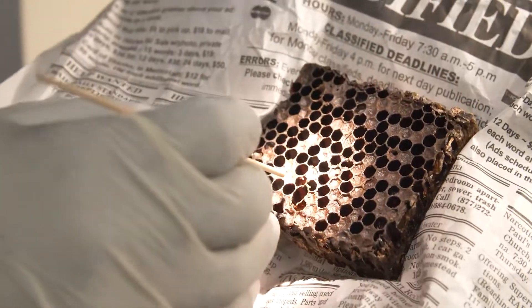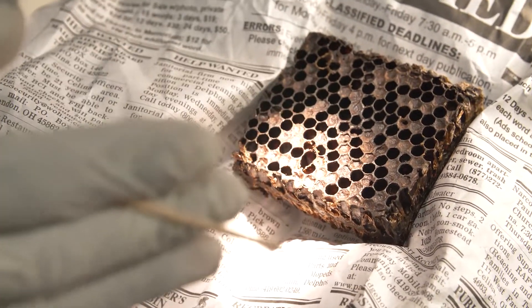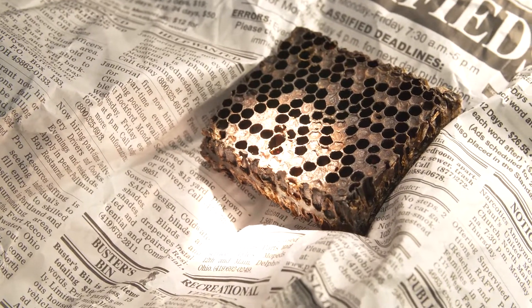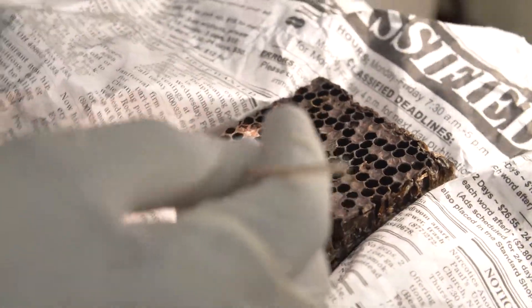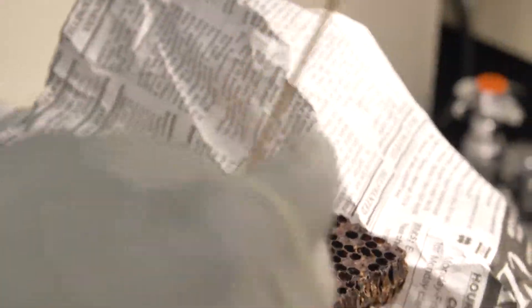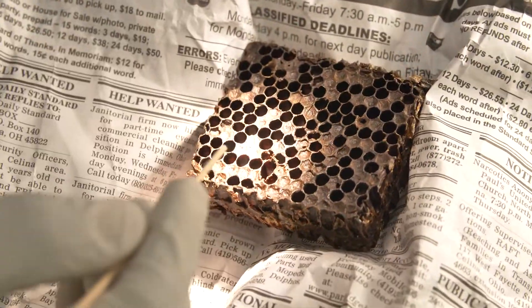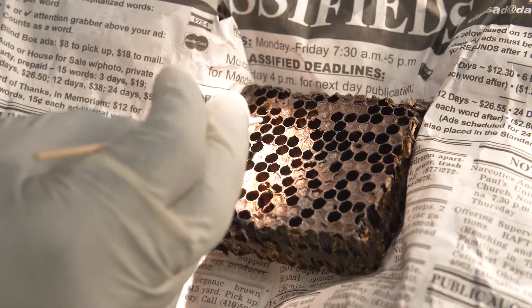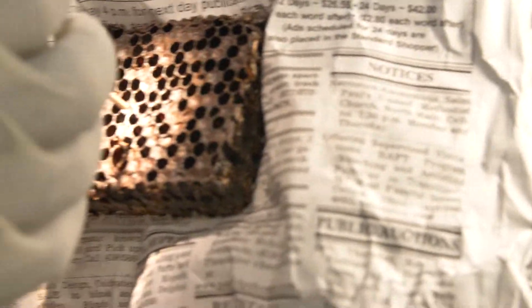What I want to determine is where the top side or bottom side of the comb is. Normally, the brood will lie on the bottom side of the comb in the cell. In this case we don't know because it's cut around, so we look at the edges of the hexagon cells and then shine light inside to try to find any brood.